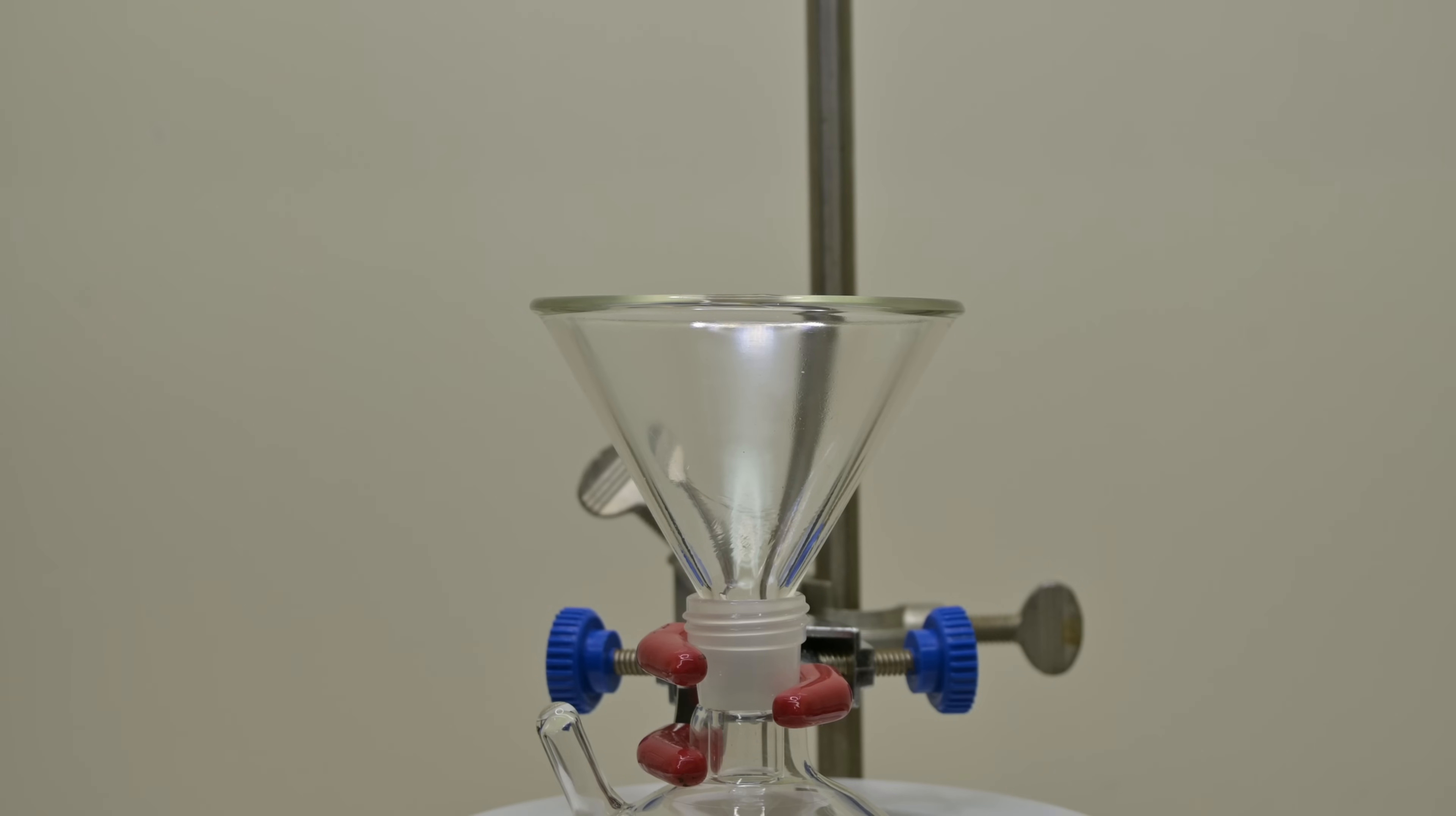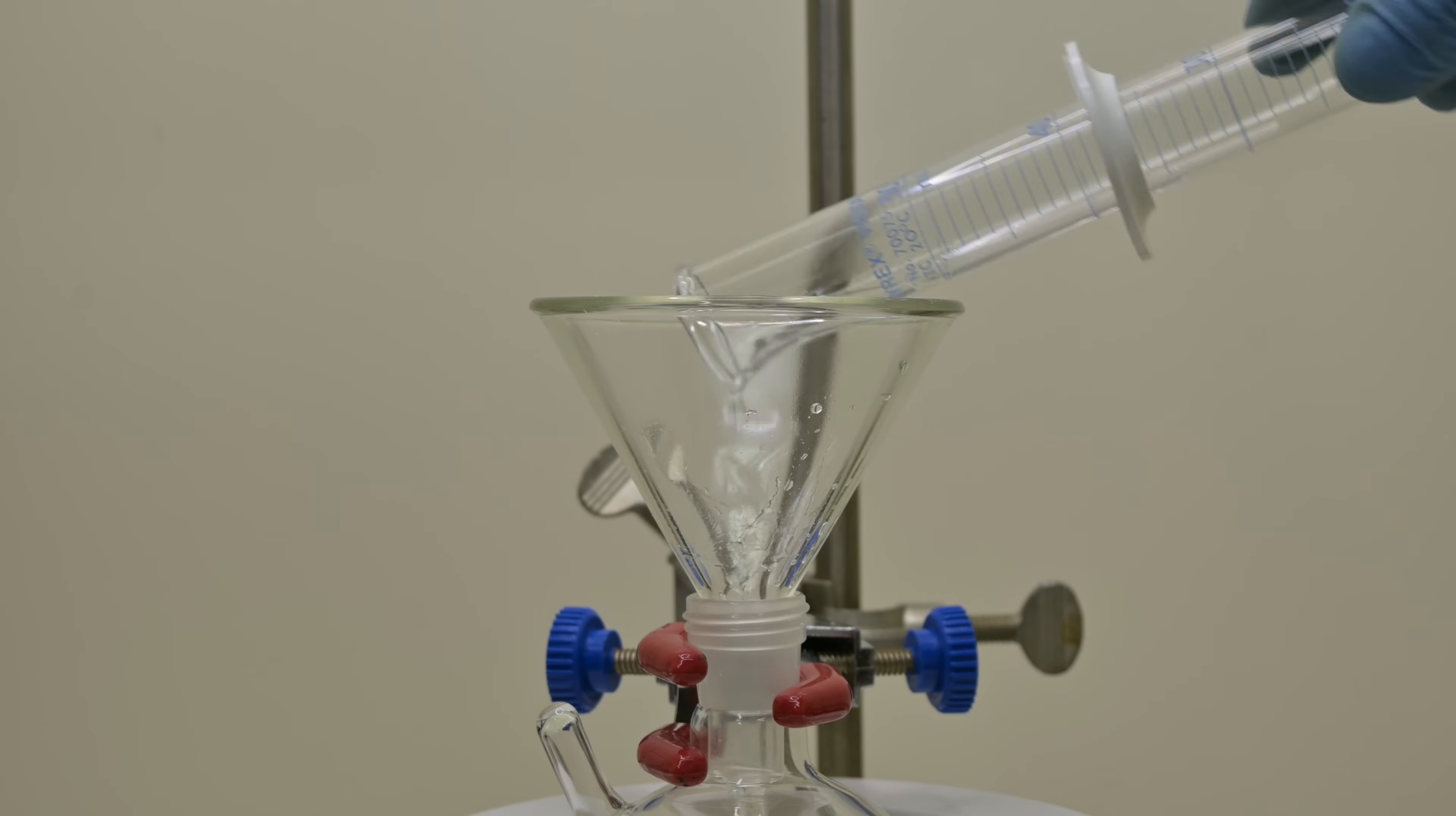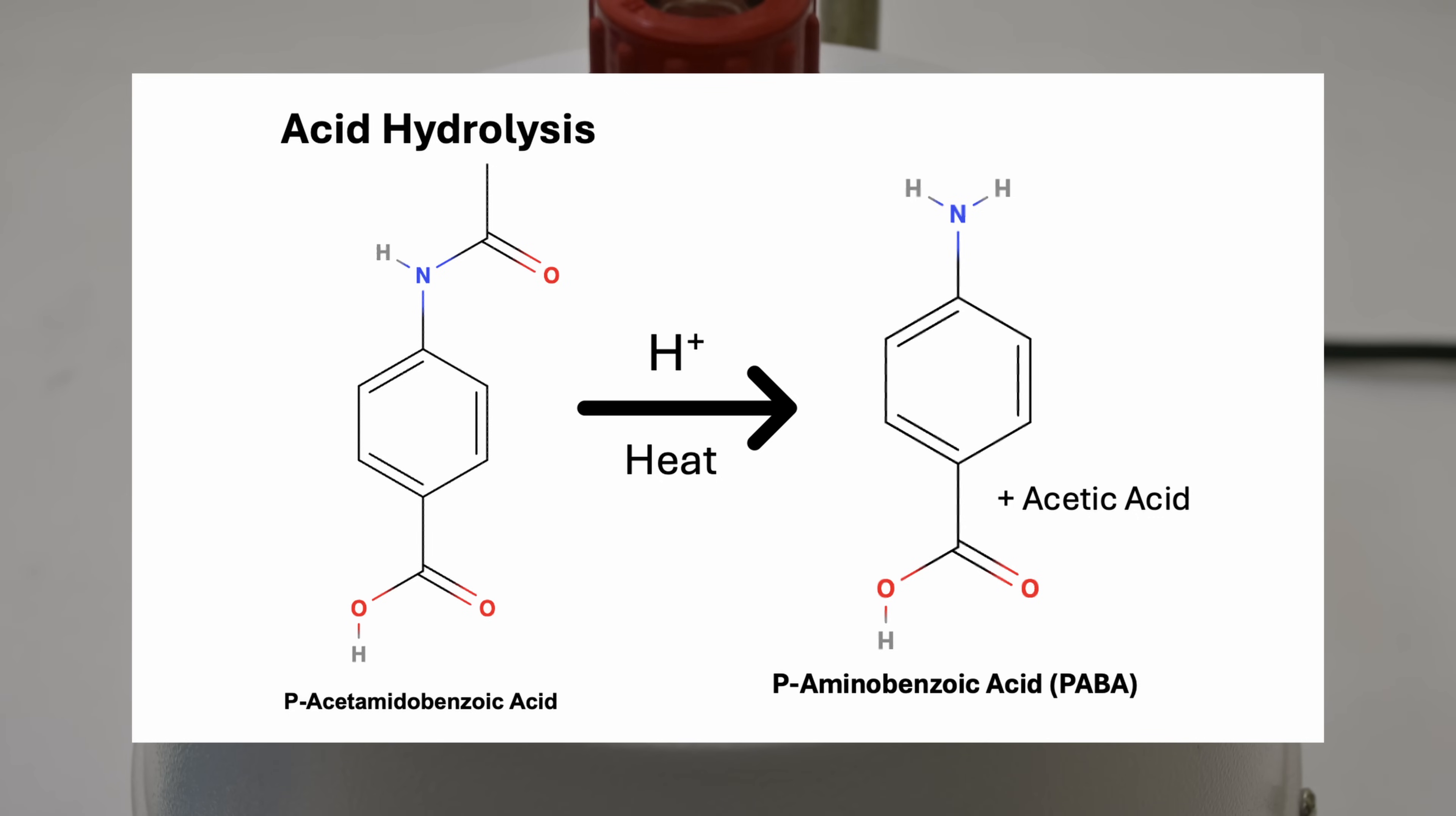I take the p-acetamidobenzoic acid I made earlier and weigh out the full amount for the next step. To break the amide bond and regenerate the free amine, I need a strong acid and some heat. So I transfer the solid into a 250 mL round bottom flask and add 33.5 mL of 18% hydrochloric acid. This solution was made by mixing equal volumes of concentrated HCl and water. The acid acts as a catalyst and provides the necessary protons to help cleave the amide during hydrolysis. I fit a reflux condenser on the flask. This lets me heat the mixture without losing any of the volatile compounds like HCl. I place the flask onto a heating mantle and gently boil the mixture for about 30 minutes. The heat helps drive the reaction to completion by providing energy needed to break the stable amide bond.